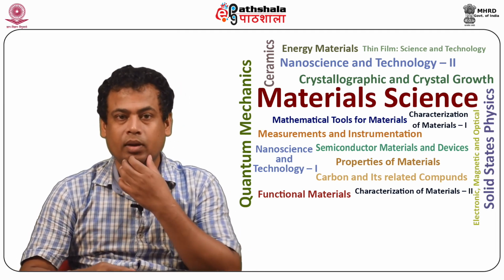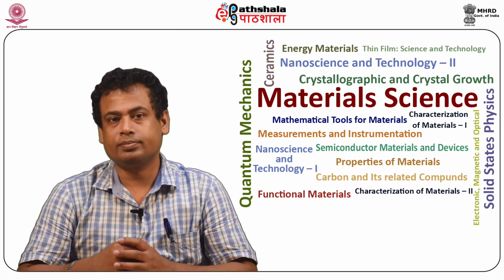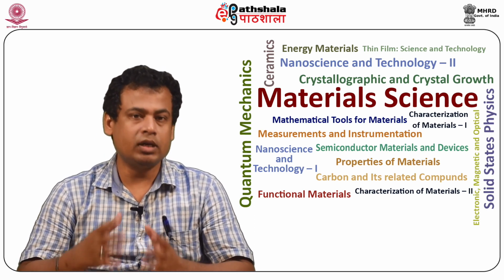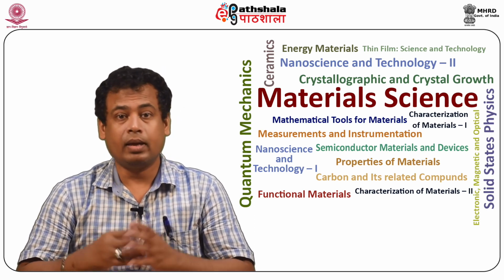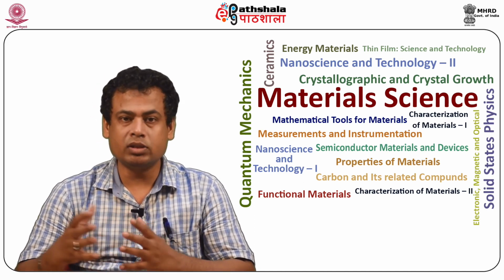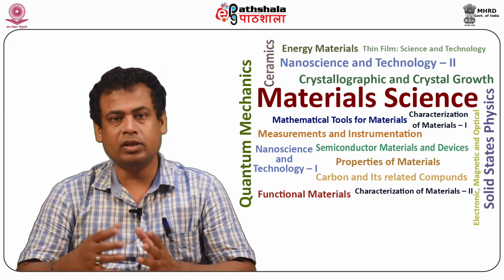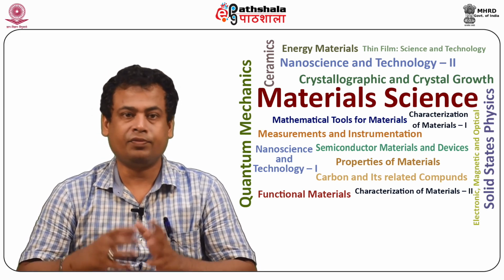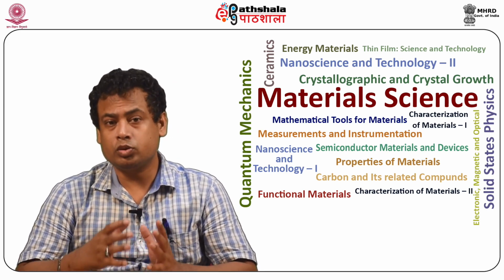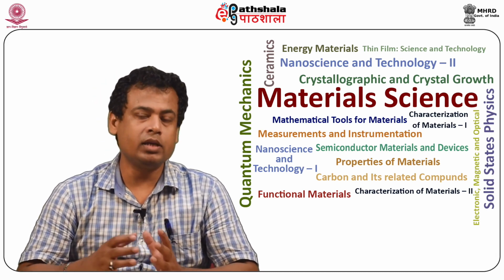So students, let us summarize what we have learned in this module. The scanning electron microscope is a versatile instrument where an electron probe is scanned across the surface of the sample and detectors interpret the signal as a function of time. A resolution of 1 or 2 nanometers can be obtained when operated in a high resolution setup.